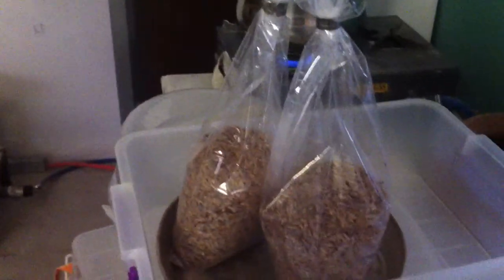This is the bag. The bag is full with grain and it looks very nice inside. It's not sterilized yet and it's only half full.